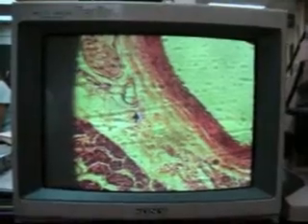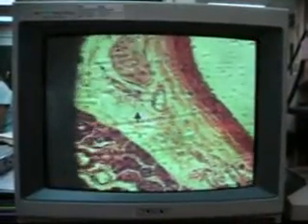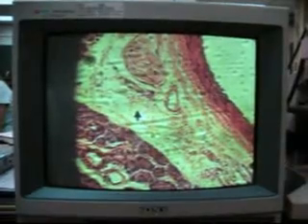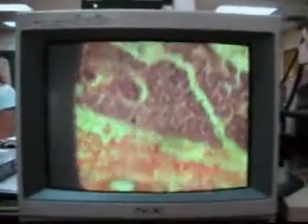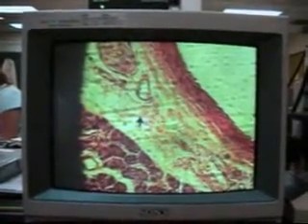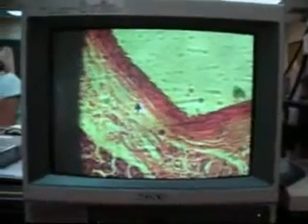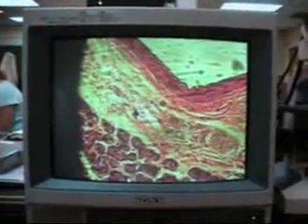So now we want to find a capillary, and remember, a capillary is going to be circular, and usually you'll see it with the nucleus. And let me see if I can find one. I found it on this slide in my office this morning, but it's really hard to see them with this crappy microscope that I have right now. Oh, sorry.